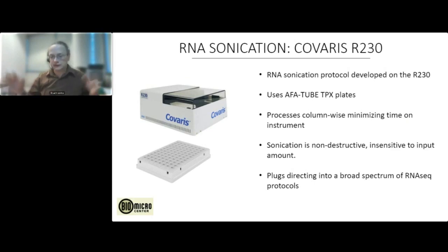And because, again, it's non-destructive, it won't take it off to the point the sample is completely destroyed. We can put almost any input amount in to have this work. And it plugs directly into a broad spectrum of RNA-seq protocols, in theory, because that fragmentation is the first step of almost every one of these protocols.